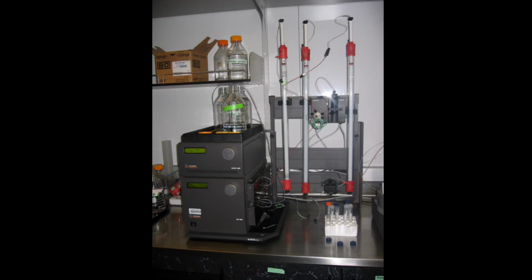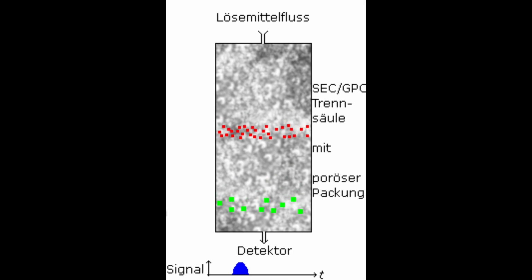Here you can see a real gel filtration chromatography setup that is used in a lab. And here is a simple diagram to explain the procedure of gel filtration chromatography as I explained above. A column is prepared with a gel matrix consisting of porous beds packed inside. The gel matrix contains pores of different sizes.